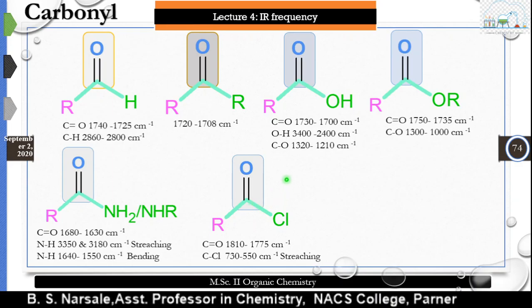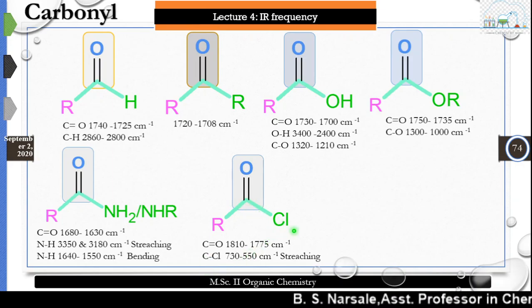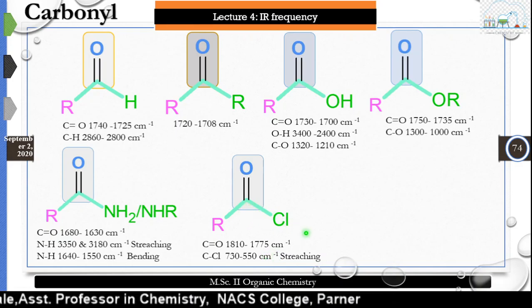That of acyl chloride, the carbonyl stretching frequency is higher, 1810 to 1775 per centimeter, and again the carbon-chlorine stretching frequency, as chlorine is electronegative, C-Cl, is 730 to 550 centimeter inverse. This stretching frequency will be observed.